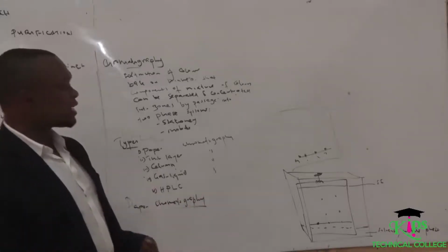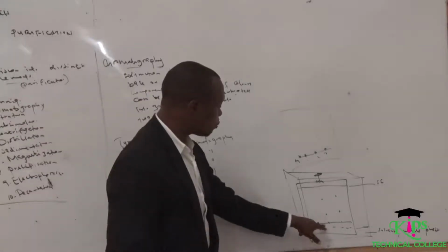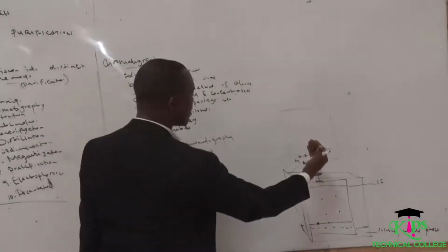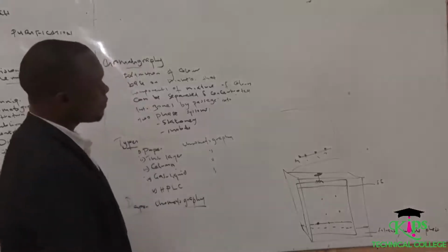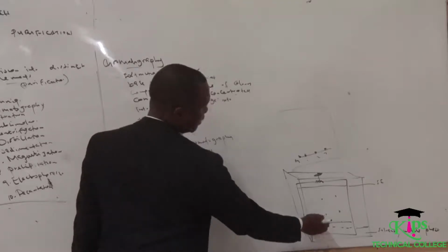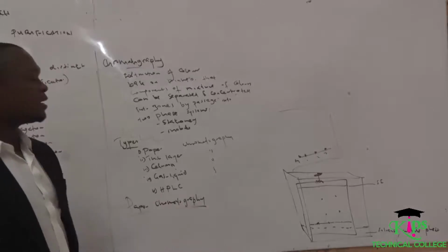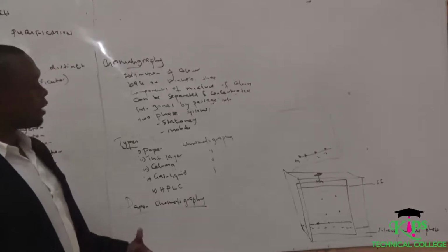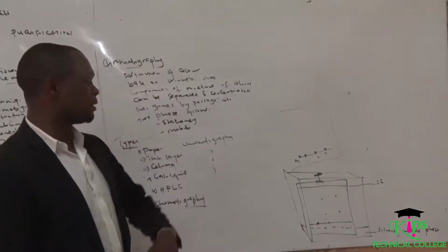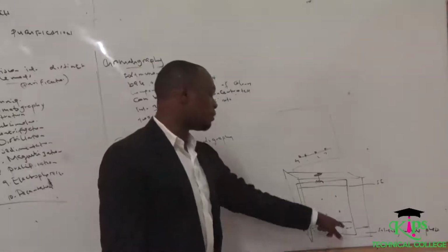Solvent front basically is the solvent itself. The solvent normally acts as the mobile phase, carrying along with it colors from this base point where we have placed our colors. As it moves along the paper, because it has an affinity, it is going to carry along with it the ink components in these three main spots we have made in our paper of the three pens used in writing the message. Remember, we are trying to find out which ink was used in writing that message because all of them are blue. So to help us, we carry out the simple experiment.